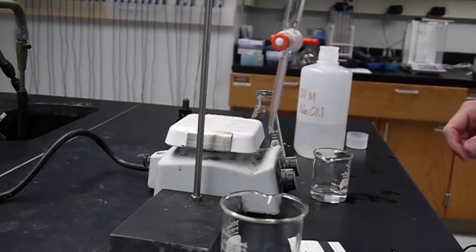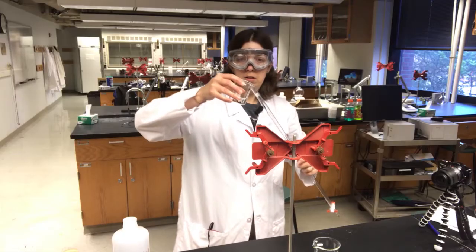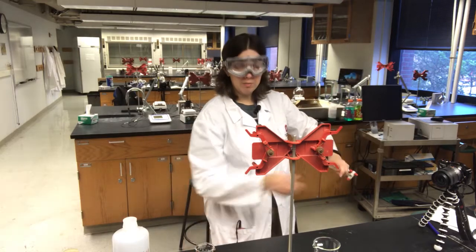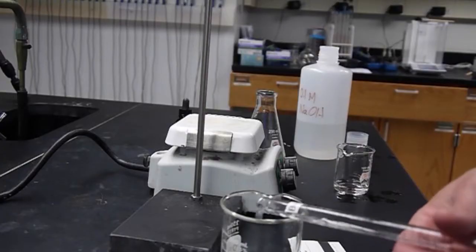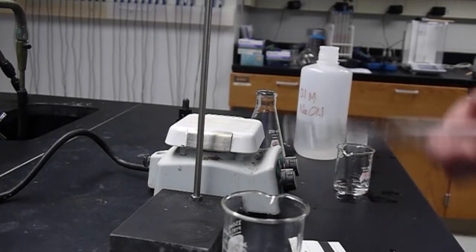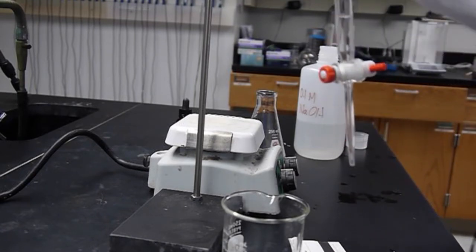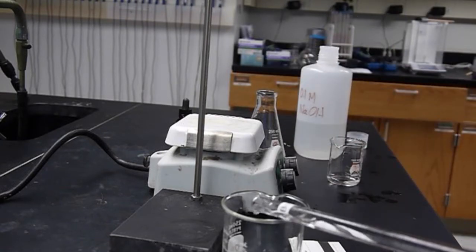Once the sodium hydroxide has drained from the burette over a waste beaker, I'm going to add a little bit more sodium hydroxide for one more rinse — down the walls again — and then drain directly into the waste beaker. I've rinsed the tip of the burette really well at this point, letting probably 10 or 15 milliliters of sodium hydroxide run through the tip. I'm going to do this a couple of times to be really careful about cleaning my burette.